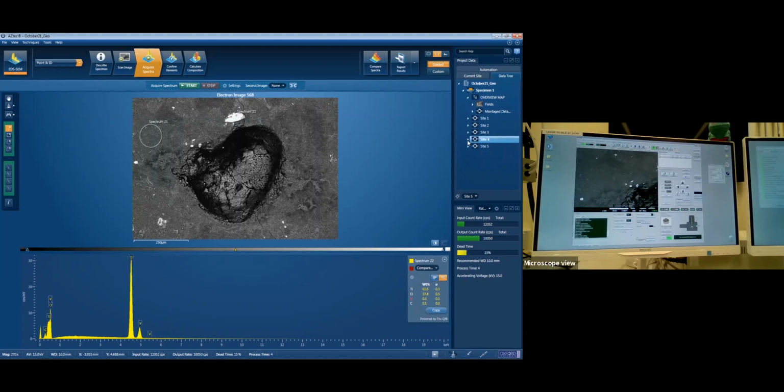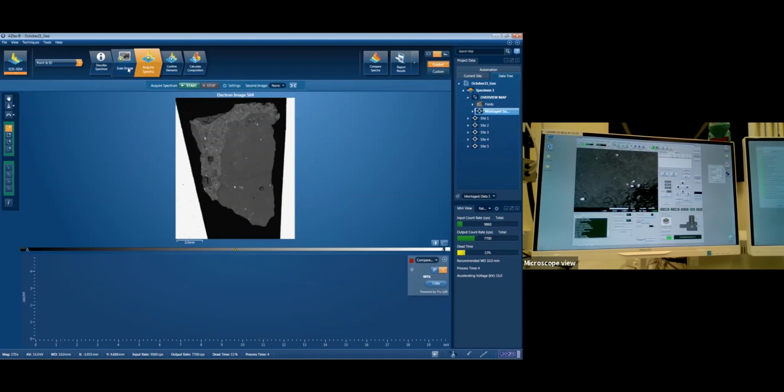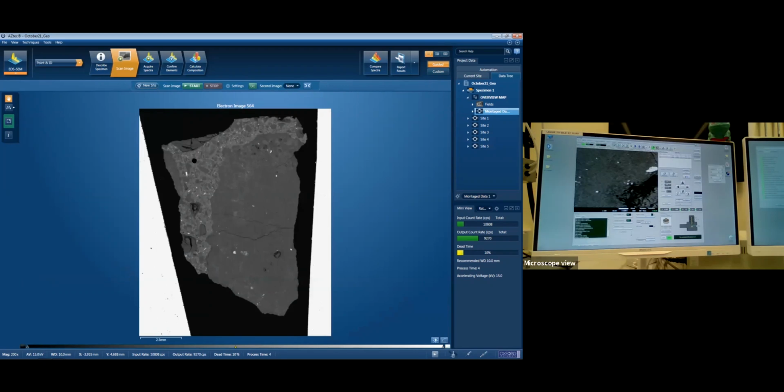That's kind of this area. It's this weird fuzzy texture, isn't it? I think these darker patches through here are probably the result of either oxidation, or it could be some hydrothermal stuff. But if we go back to the overmap, where are we? Montage data. And so we've done this bit up here. We've looked down here.